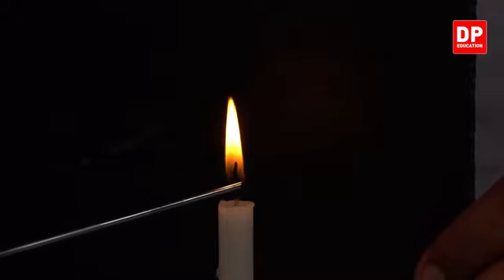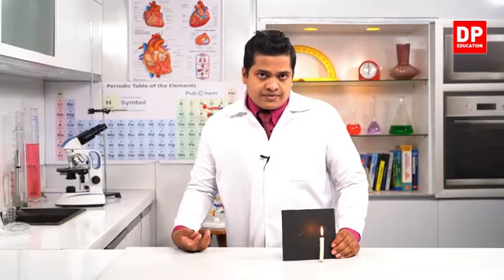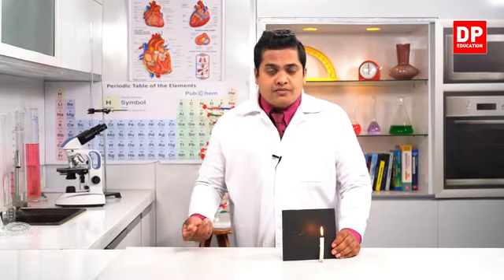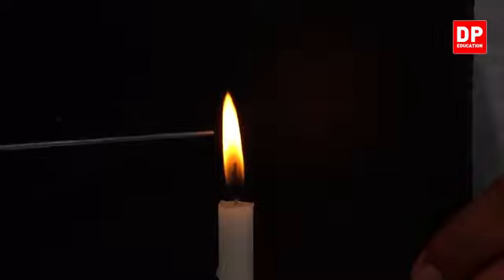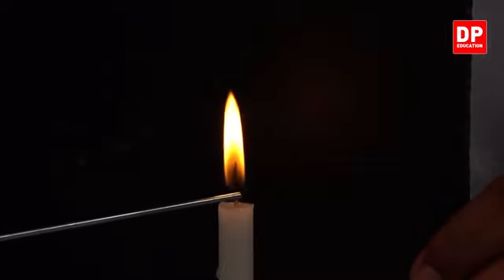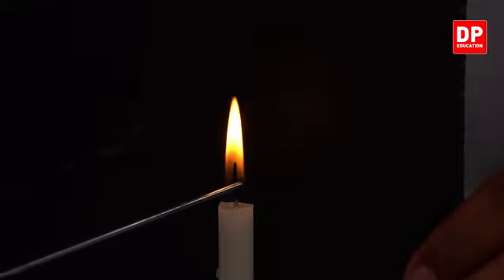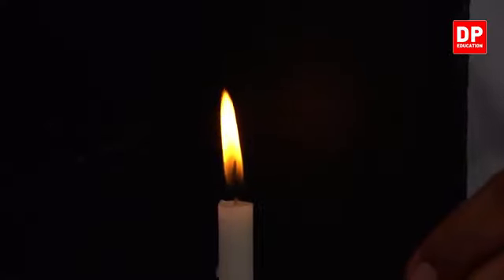Then after that, below the luminous zone, when you come up to here, within this area, there is a flame, but we can't observe it very clearly. Actually, it has become invisible and transparent too. Transparent means invisible here. You can directly see the black surface in this area. You can't observe a flame, but the flame is there. It's because that area is invisible to us.